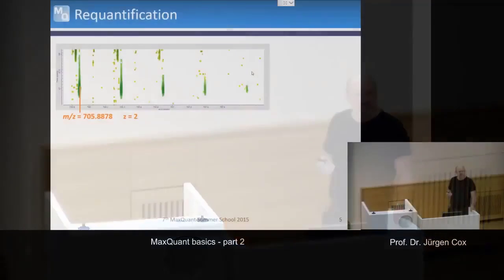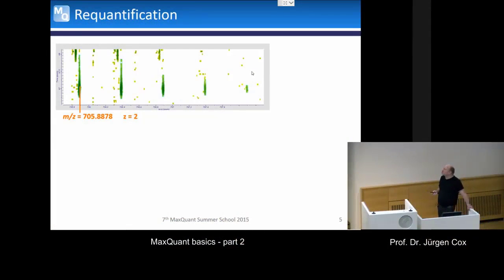Okay, here there is something on this slide. So now we continue with the algorithmic stuff that we stopped with in the previous part of this MaxQuant basic session. I'm going now through a couple of important features that belong to the standard repository of MaxQuant algorithms, and that are needed for all kinds of steps in making your data good. One of these is the requantification step.